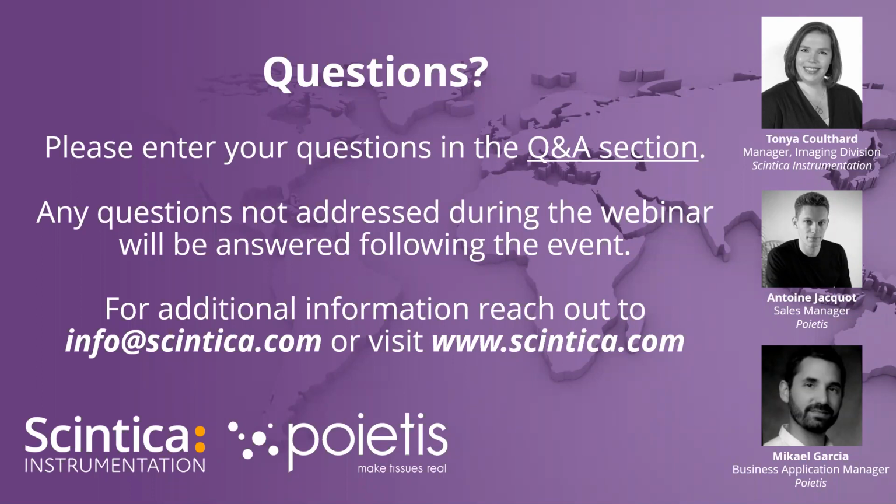Perfect. Another question is how do you go about printing complicated 3D parts? And I'm going to perhaps take that a step further in terms of complicated 3D tissues. And can these be imported and have the software basically take over and do everything automatically? I think this question was asked perhaps earlier on in the webinar, and I hope that what we were able to show was that you design it layer by layer, but once you've used the HMI software to program that sequence of fabrication steps, the computer does take over and everything is built automatically once you've told it the different shapes and the structures and the thicknesses and the sizes that you want and at what point you want cells included in that material or that scaffold as well. Antoine and Michael, I'm not sure if you wanted to add anything more to that.